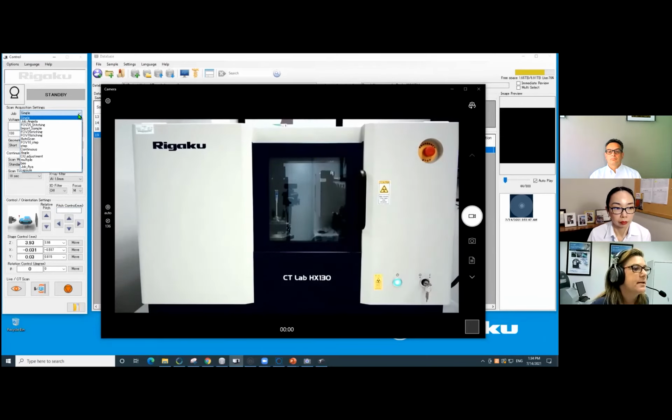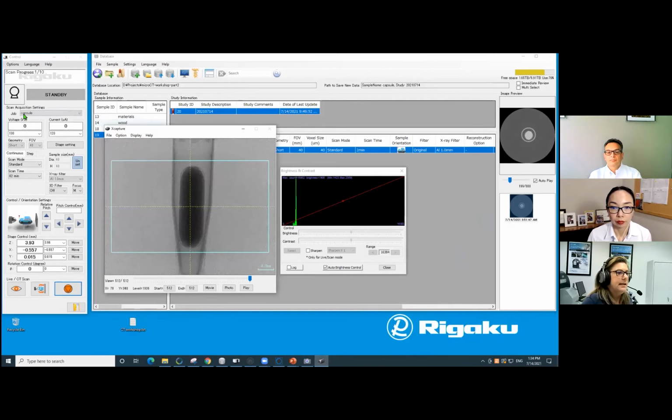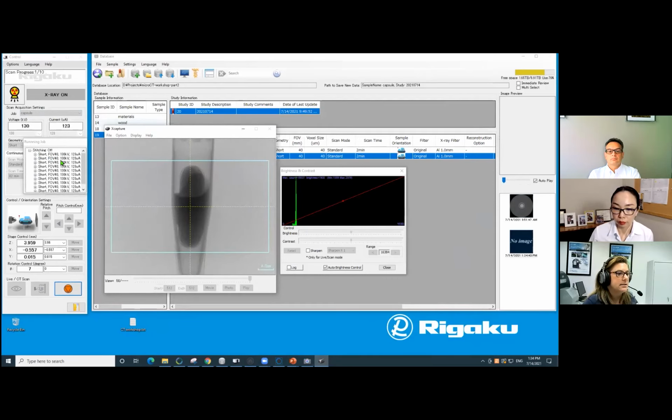So I have set up a set of canned experiments, and I'll review them in just a second. I want to get them started. All right. So in terms of the HX software, you can set up a number of scans to collect, and that's called a job. What I've done here is I've selected a job called Capsule. Basically, this is going to collect 2-minute images back to back to back to back, and we're just going to observe what's happening to this pill over time. And you probably noticed I didn't collect a 0 time point. Well, that's because I did that in advance of the workshop.